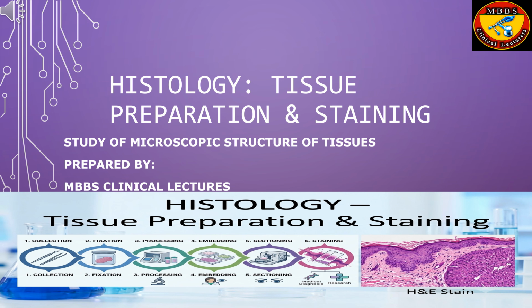Today, we will discuss histology, tissue preparation and staining. Histology is the branch of biology and medicine that deals with the microscopic study of tissues. Since most tissues cannot be properly examined with the naked eye, special techniques are used to prepare tissue samples for microscopic observation. The process involves several important steps including tissue collection, fixation, dehydration, embedding, sectioning, and staining. These procedures preserve tissue structure and make different cellular components visible under a microscope.